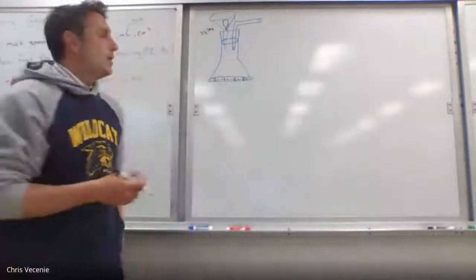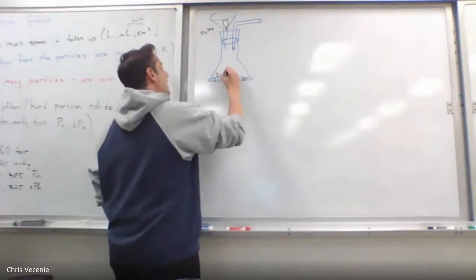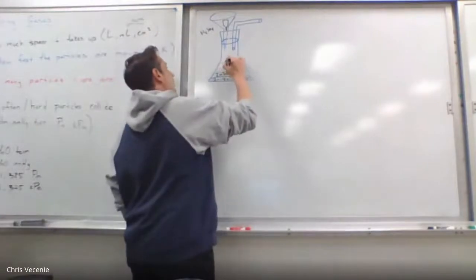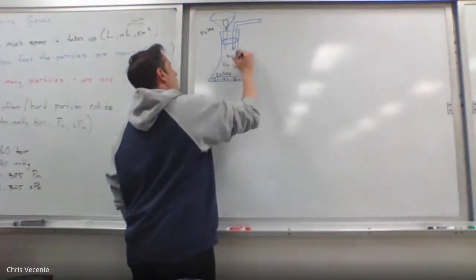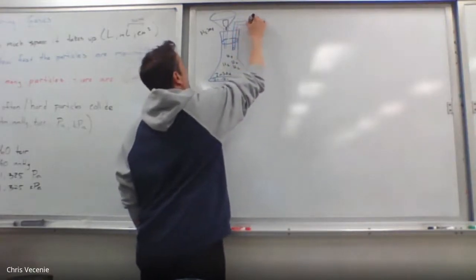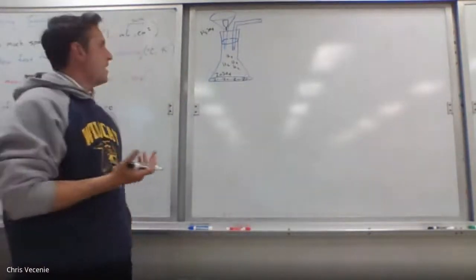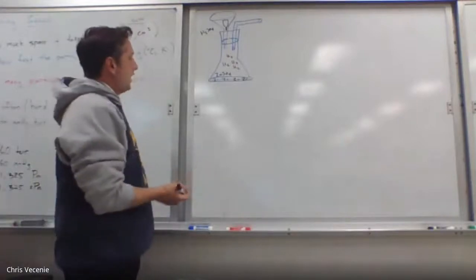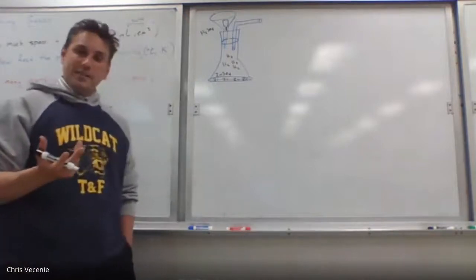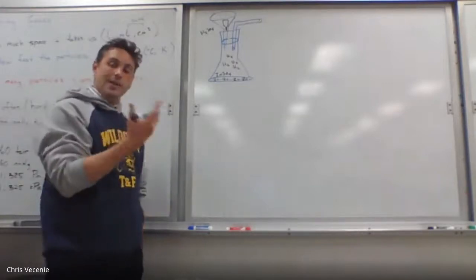So when we inject the H2SO4, it's going to hit the zinc. They're going to react. We're going to get ZnSO4, which is going to stay dissolved in the liquid. And we're going to get, hopefully, a bunch of H2 gas molecules that want to go up and out. Now, right away, you're confirming some things about properties of the gas. Like, if we can manage to collect the H2 using water displacement, you know it equally has a low density, right, like the oxygen did, because it's able to push up through the water because it's less dense.